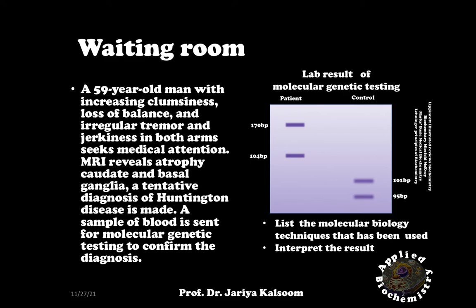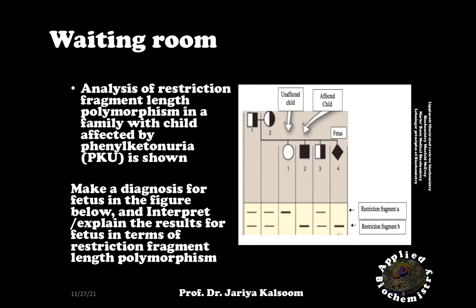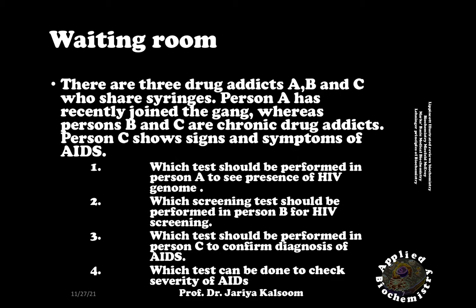PCR applications include mutational analysis, paternity testing, RFLP analysis, confirmation of diagnosis for certain infections, forensic analysis, and detection of subclinical infections.